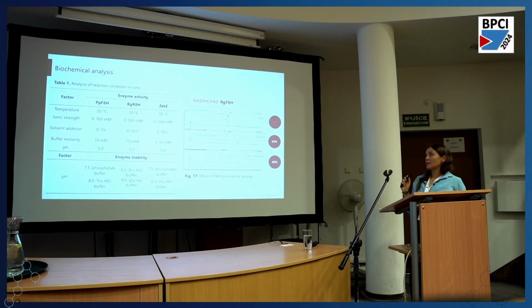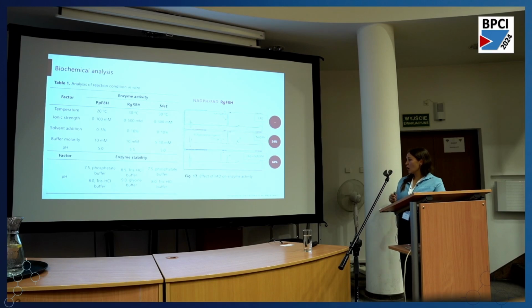That's about the coenzyme addition. Only for the enzyme from Rhodotorula glutinis, we observed that the extra addition of FAD increased the naringenin conversion.